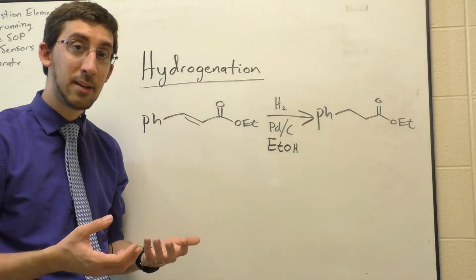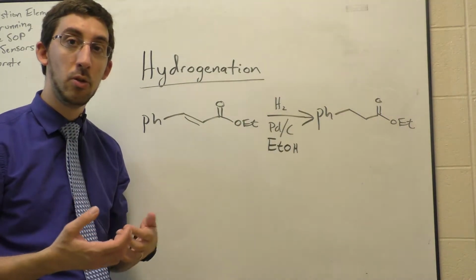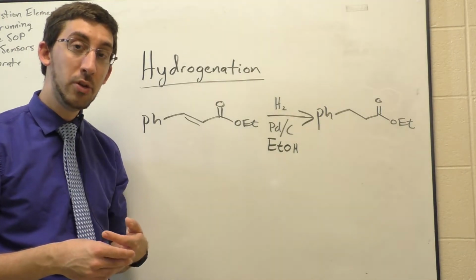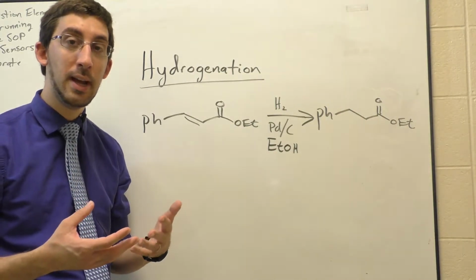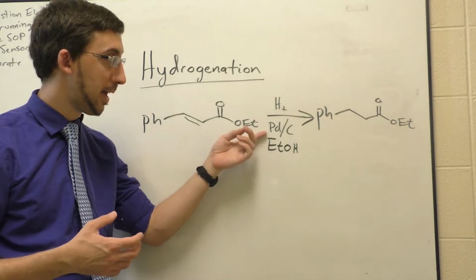And it's very active, so it's useful for hydrogenation of alkenes, alkynes, reduction of nitro groups to amines, as well as some other applications. It's also tolerant of water and tolerant of alcohols, and so that makes it very useful in many applications. So we'll have some of that catalyst.